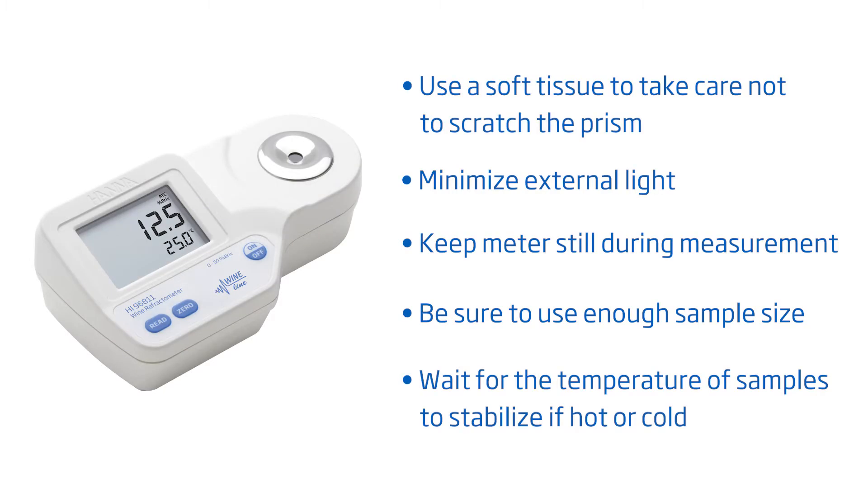To get you started right away, here are some tips to follow for best results: Take care not to scratch the prism. Minimize external light. Don't move the meter during measurement. Make sure to have a sufficient sample size and no bubbles on the prism. Wait for the temperature to stabilize if your sample is hot or cold.